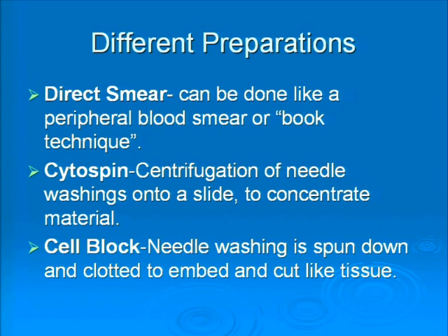So when you're over there, we can practice making slides if you haven't done that with smear methods, or this pop-apart method. Cytospins are what we make from that rinse media. Typically, they're just a cytocentrifuge concentrated sample, and it gets a pap stain on it. And then a cell block. And cell blocks are very rarely used for thyroid FNA.